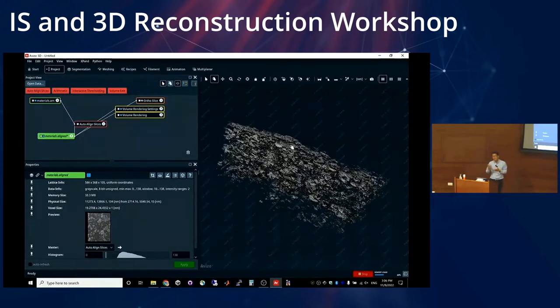So one hack that we did with this data set was also resample. That means you artificially increase the resolution in Z, but you're making assumptions there, right? You're making assumptions that your data is smooth. But maybe you see the structures better. So anyway, I have to go to the other data set, but now, for example, after we do the alignment, we can do denoising and then use thresholding to get some pretty nice results. But the main thing I wanted to show here is the alignment, okay?